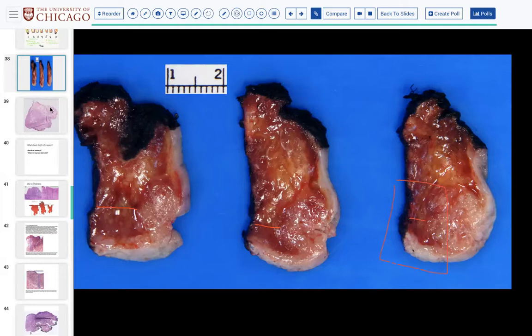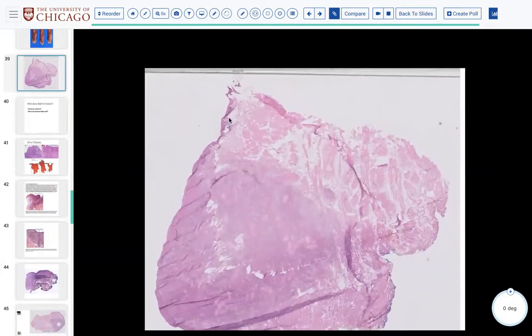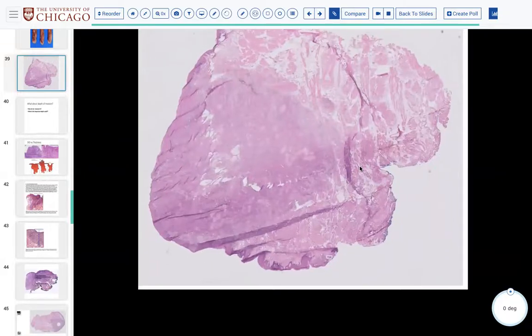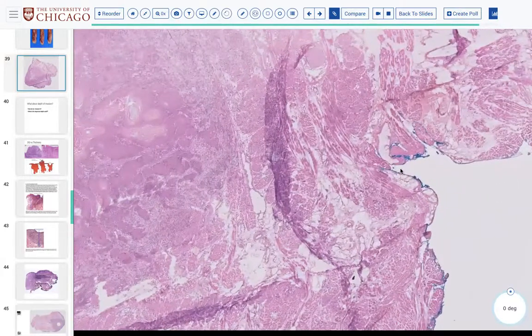And so here's what it looks like. So, as expected, you have your mucosa around the top and side, and then you have your tumor here, and you have nice ink. And so, I mean, this is a very, very clean, well cut example.